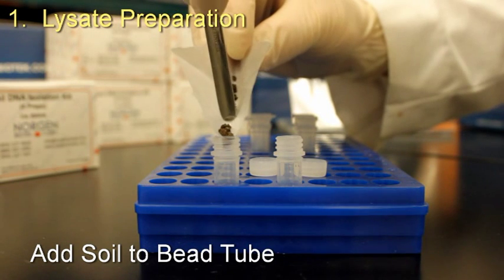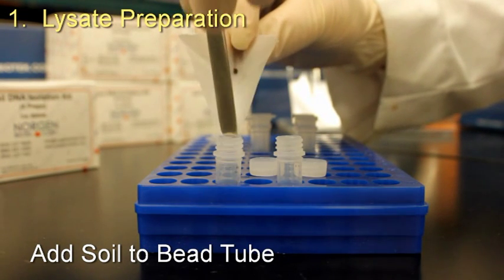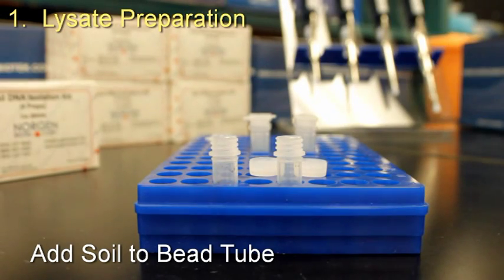Add 250 milligrams of soil sample to the provided bead tubes. Using a weighing paper or weighing funnel will help with this.